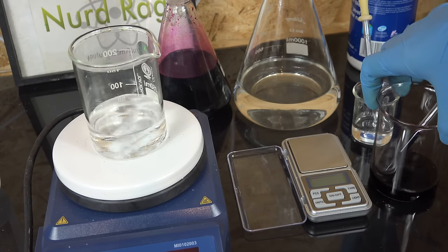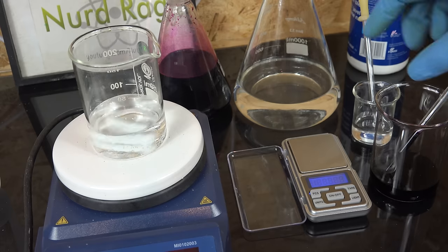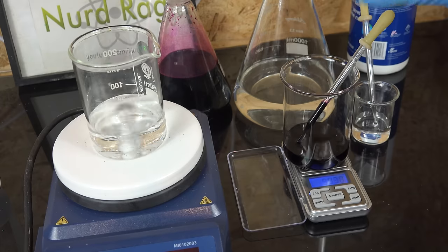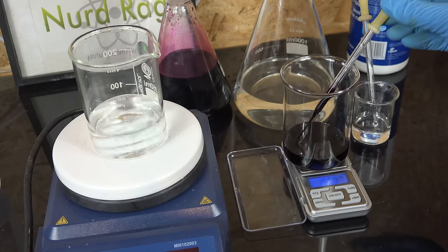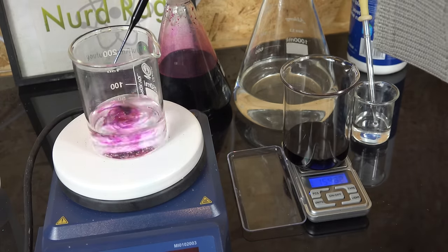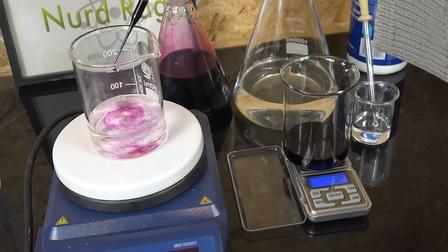The most direct way is to react the hydrogen peroxide with something of known concentration. When all of the hydrogen peroxide is reacted, if we know how much of the reactant was used, we can calculate how much hydrogen peroxide it reacted with. And that's the concept of titration.